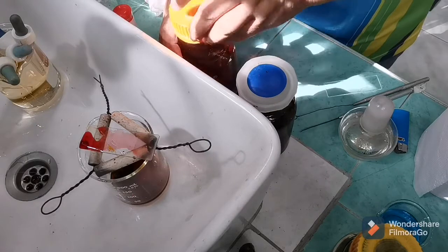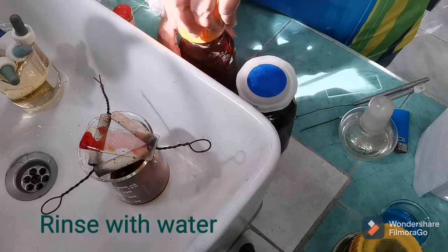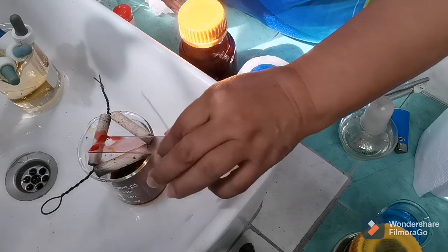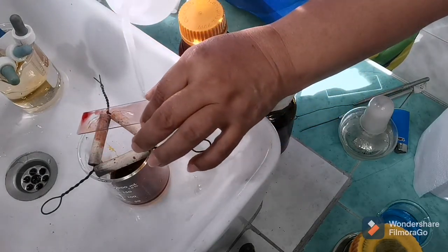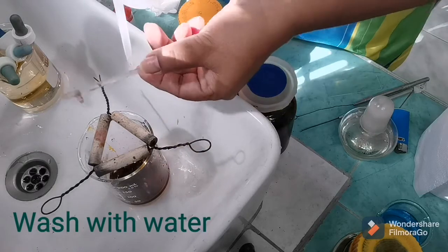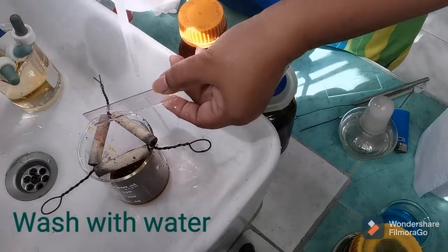After 30 seconds, we're going to rinse with water, and then we blot it dry, and then we focus under the microscope. So this portion that we are doing right now is the staining process. The microscope analysis will be done after.